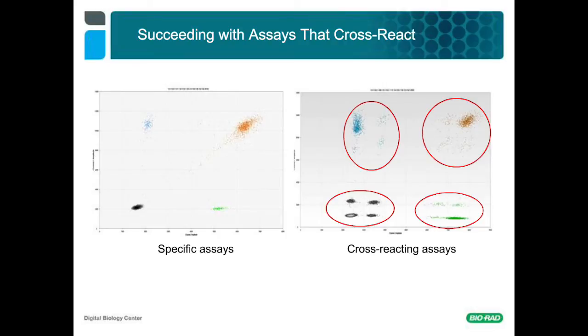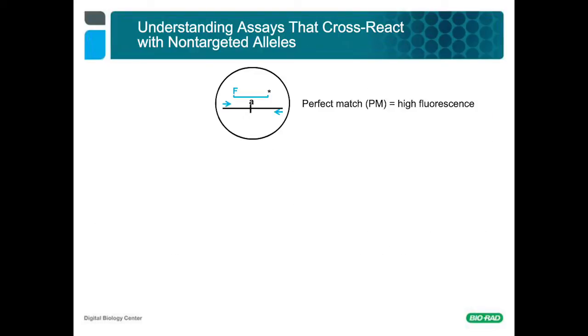Here I've illustrated a droplet containing a DNA molecule in which a lowercase a is the variant of interest. The FAM probe used in this assay matches perfectly with the sequence of this variant. During PCR, we expect this target to be amplified by the included primers during every round of thermocycling and the probe to land on the amplicon and experience cleavage, thereby separating the fluorophore from the quencher and allowing this droplet to progressively increase its fluorescence with every added cycle of PCR until the reagents become limiting.